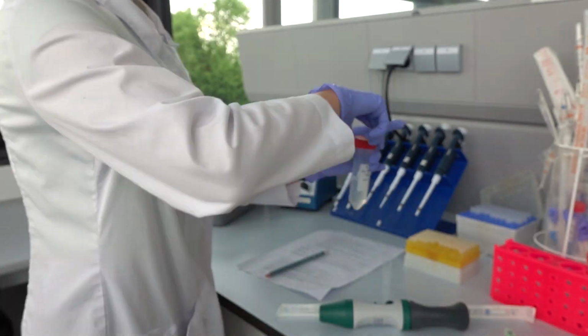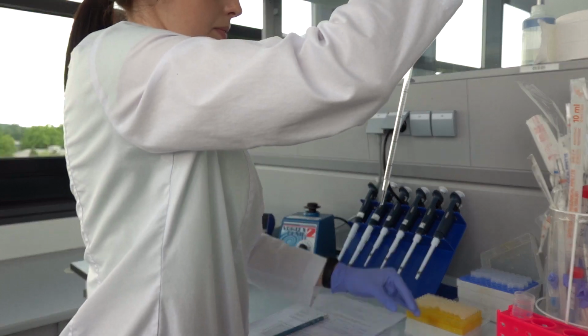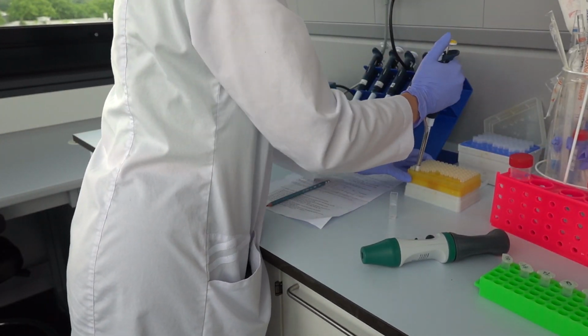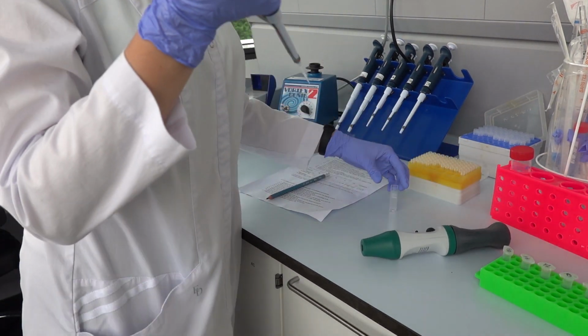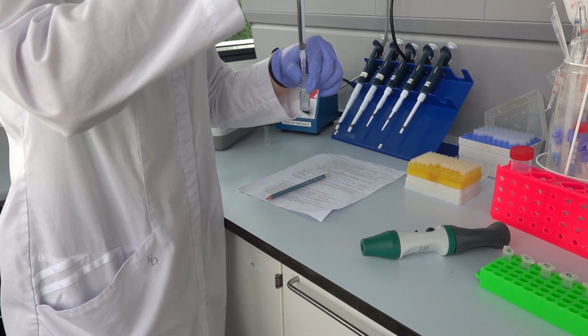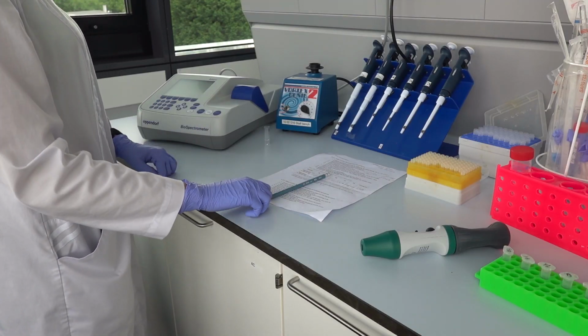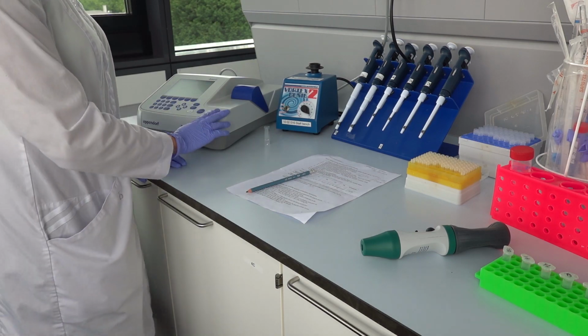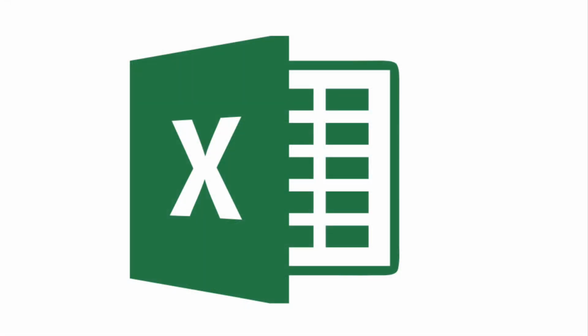In the end, the procedure is repeated again for lysozyme positive control. The experiment is now done, but how can you get the specific activity? We will work in Excel to figure this out.